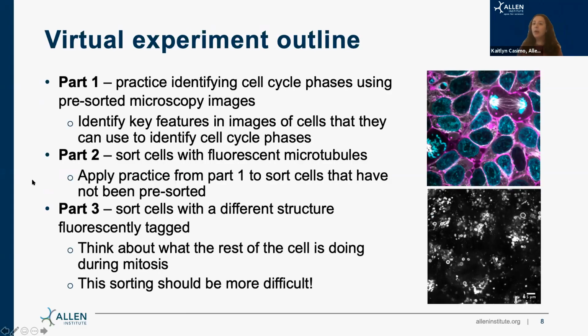All right, so now I'm going to walk through the actual data collection. You can follow along with me on my computer. I'm going to screen share on our website, or you can do this on your own computer as well. So there's a 3-part section to this data collection. Again, all of this is in the packet.